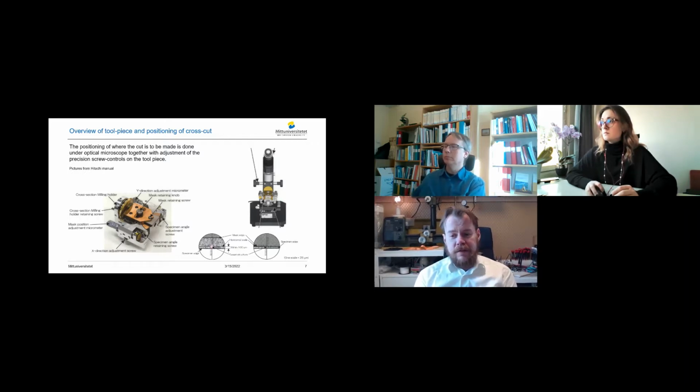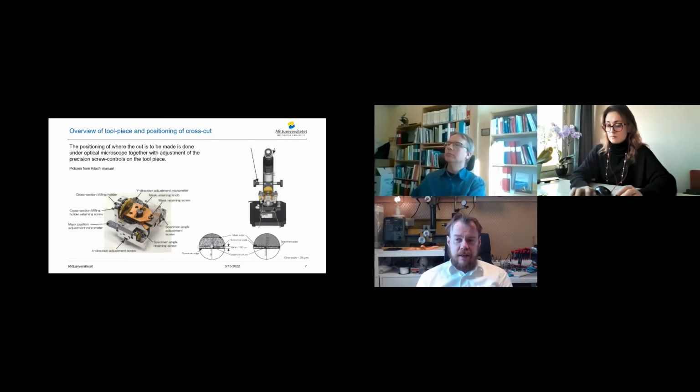What these optical microscope images show is that you want to position the titanium mask so it covers the bulk of your sample, and only a small fraction sticks out and becomes exposed to the plasma beam. There's a reason for that.